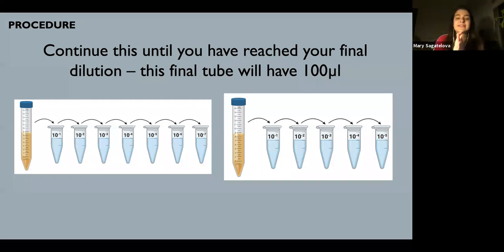Hopefully that makes sense. The final tube, the very last one, is going to have 100 microliters in it. You're just transferring 10 to 10 to 10 to 10. Okay.